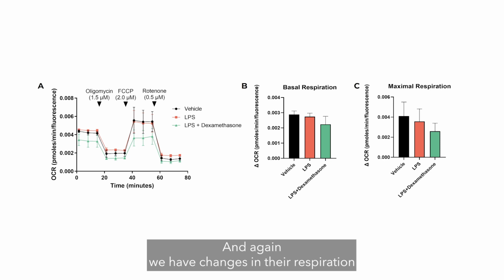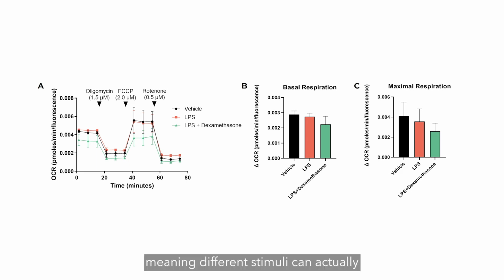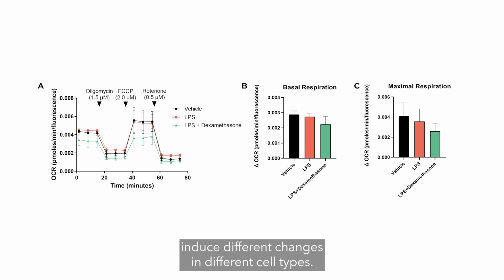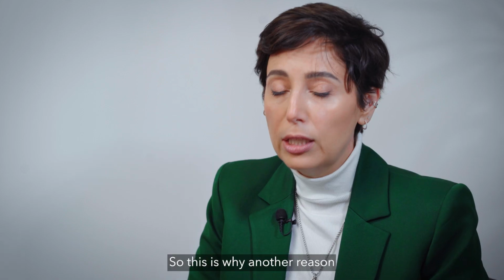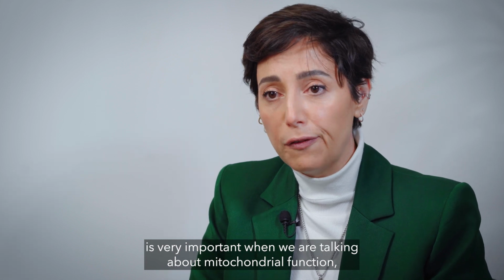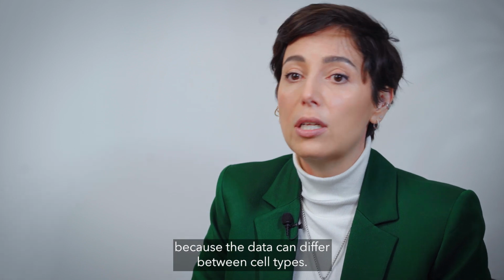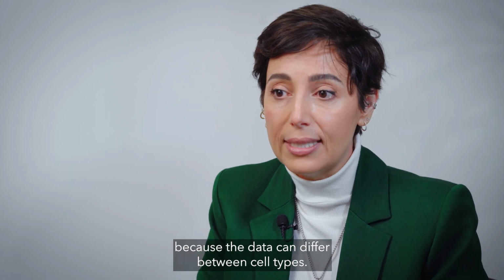And again, we have changes in the respiration, but they were not significant in relation to the control cell lines, meaning different stimuli can induce different changes in different cell types. So this is another reason why it is very important, when we're talking about mitochondrial function, to measure different parameters in your specific model, because the data can differ between cell types.